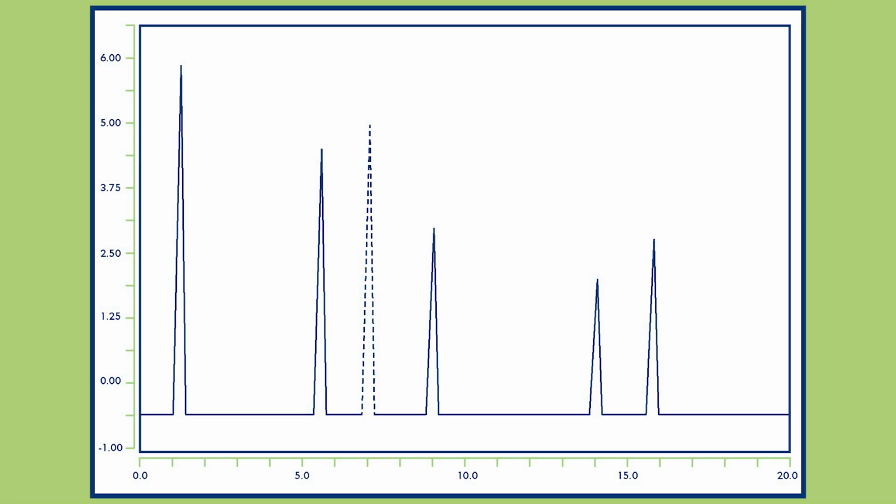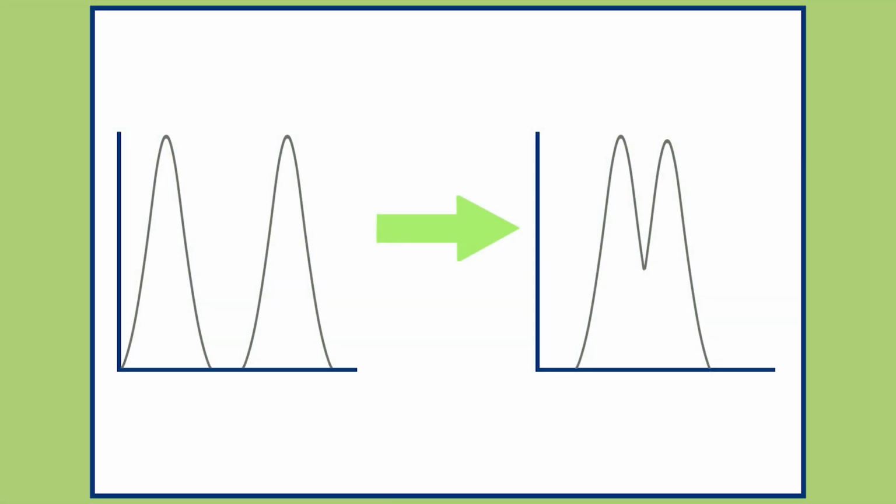Second, look for missing peaks or negative peaks. When you run standards, you should see all the peaks associated with the ions in the sample. If not, then the column has been compromised and needs fixing. Also, negative peaks where there aren't normally any could indicate an issue. Lastly, look for poor resolution. What I mean by this is that peaks that are normally separated appear to slightly overlap. This can cause issues with the algorithm that integrates the peaks.